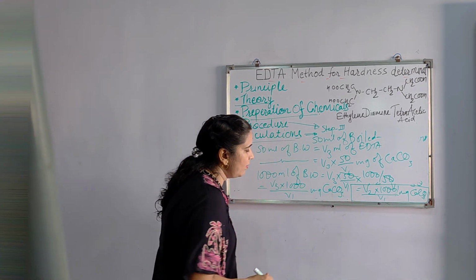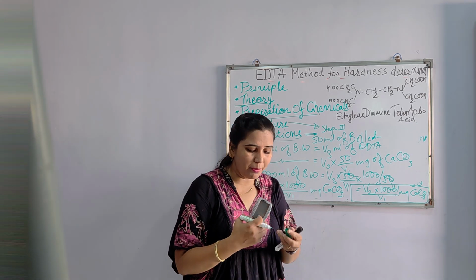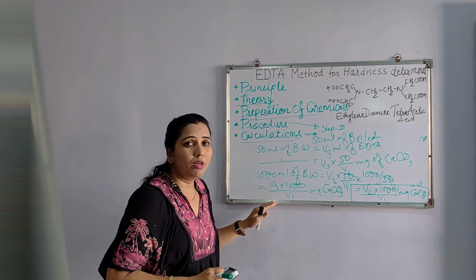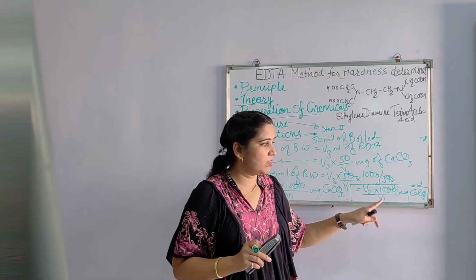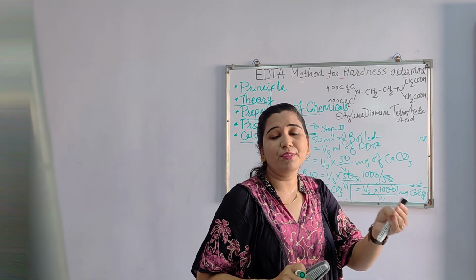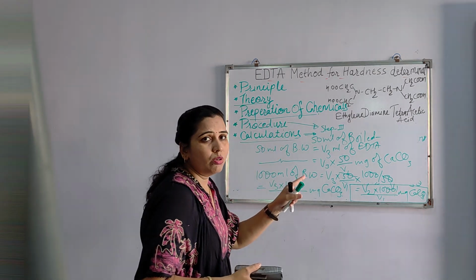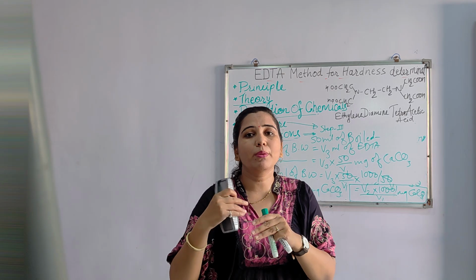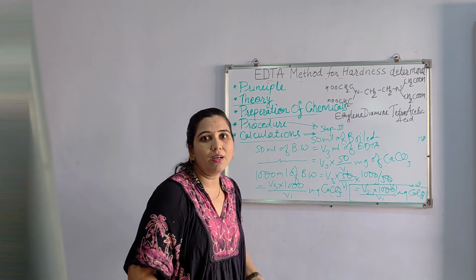So what we have got here is the hardness which is there in our boiled water sample. As we have already removed the temporary hardness from the water by boiling it, this is the permanent hardness only. While this other hardness is the total hardness, because while using this hard water we have not done any procedure with the unknown water sample. It is just taken and used. So from these two, as we know that total hardness is equal to permanent and temporary both, by subtracting this hardness from the total one, we will get the temporary hardness.